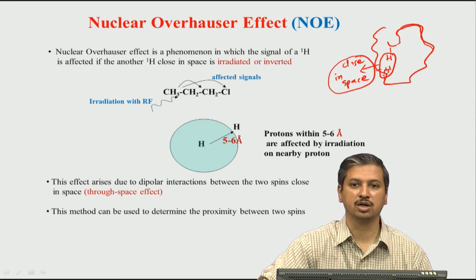That information would not have come from any other method in NMR like COSY, TOCSY and so on. It only comes from this experiment known as NOESY. So, therefore, NOESY occupies a very important place in NMR. In fact, for biological molecules this is very useful, because biological molecules, remember, have a very complicated shape, and the distance structural information can only be obtained through this kind of an experiment.